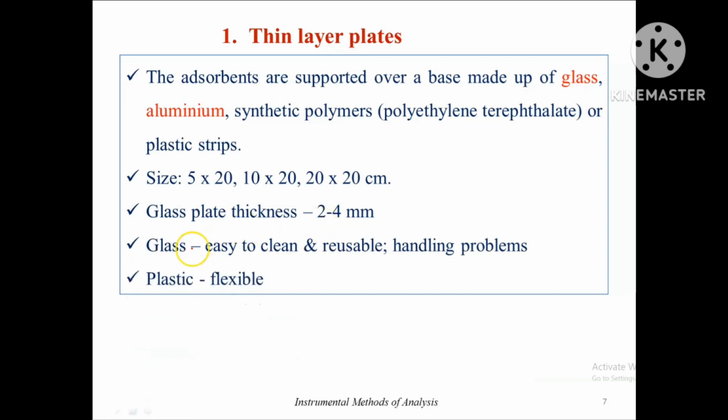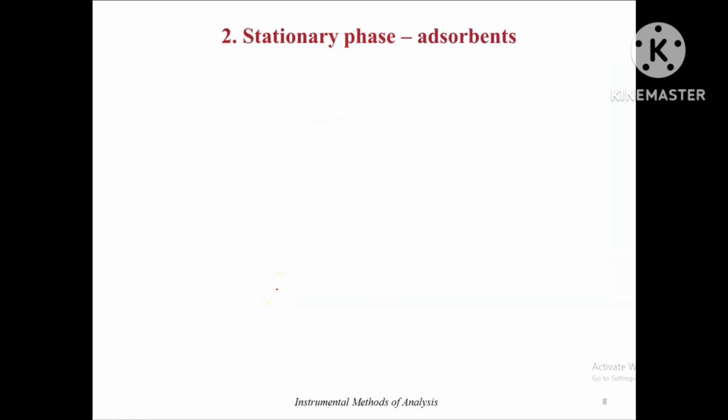Each of these materials, glass and plastic, has its own advantages and disadvantages. Glass plates can be easily cleaned and they are reusable, but there will be handling problems with glass material. On the other hand, plastic offers greater flexibility.